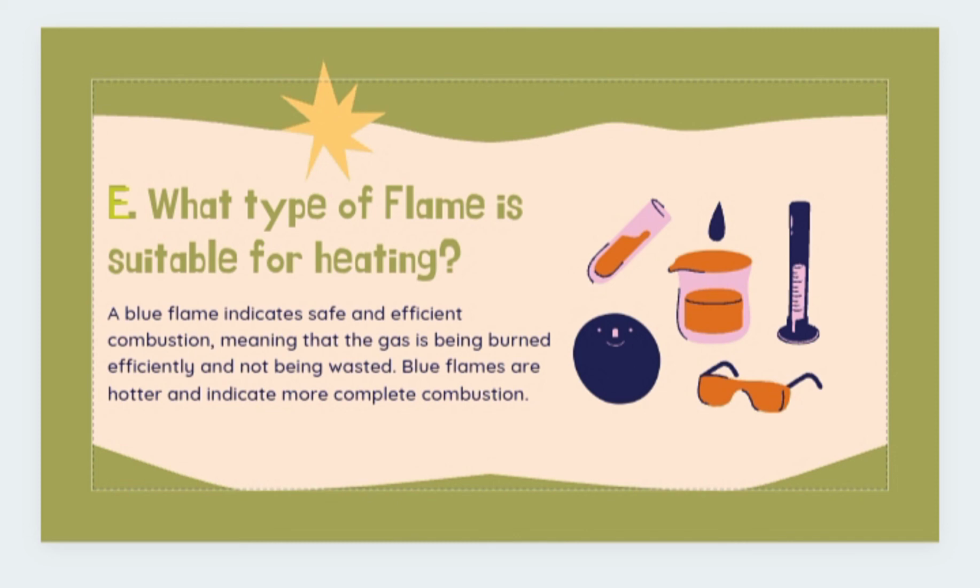What type of flame is suitable for heating? A blue flame indicates safe and efficient combustion, meaning that the gas is being burned efficiently and not being wasted. Blue flames are hotter and indicate more complete combustion.